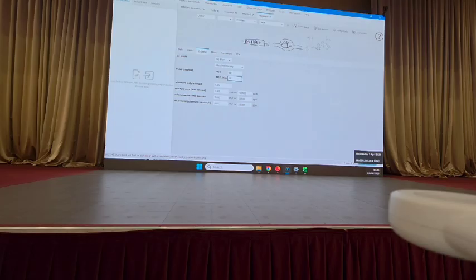Some of you might be asking, how do I determine the noise? For the sake of time, I'll not cover it at the moment. If we have time at the end, I will be happy to show you. Otherwise, there's a lot of documentation. The documentation page on this is very good at explaining it.